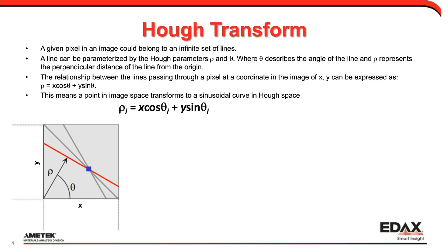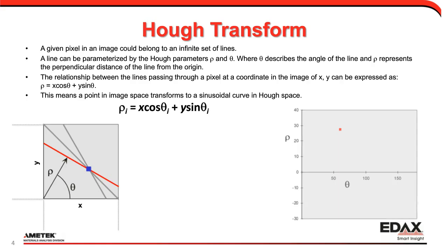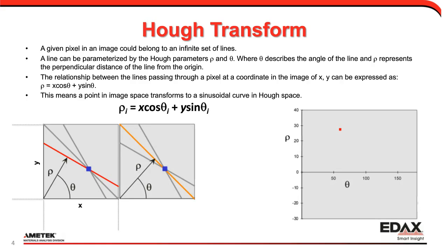What it really does is turn your EBSD pattern into what's called rho-theta space. In this rho-theta characterization, you walk through each rho and theta, find a pixel coordinate, transform it, take the grayscale values, and as you step through this, you take each point on a line, find another point on the line, and you get these rho-theta parameters that go through that point.